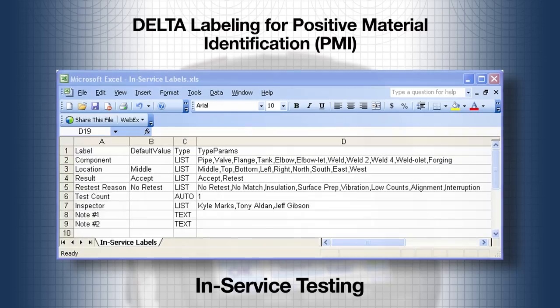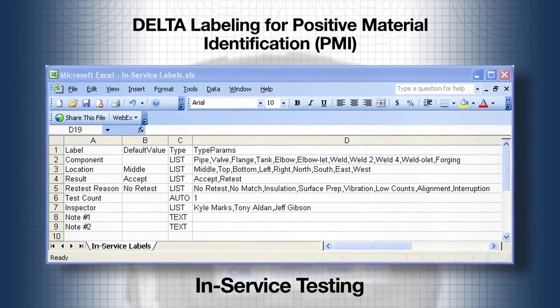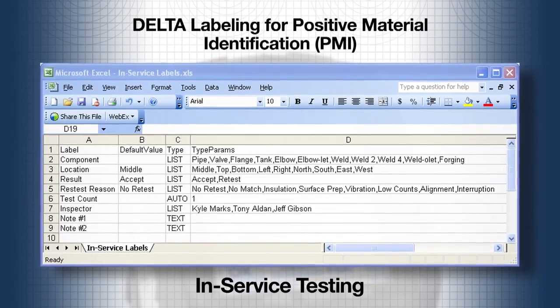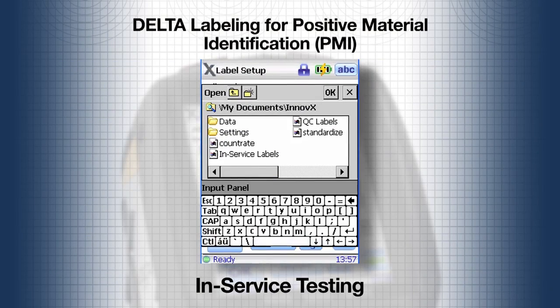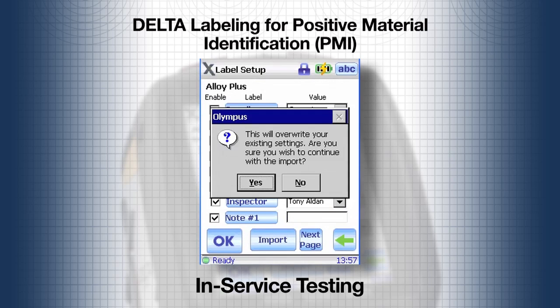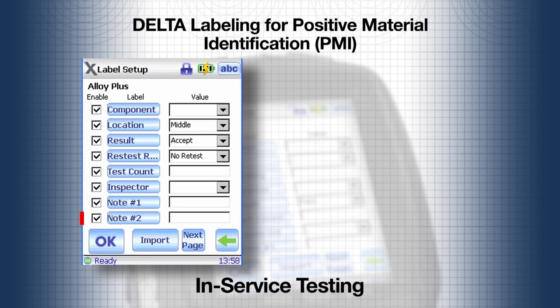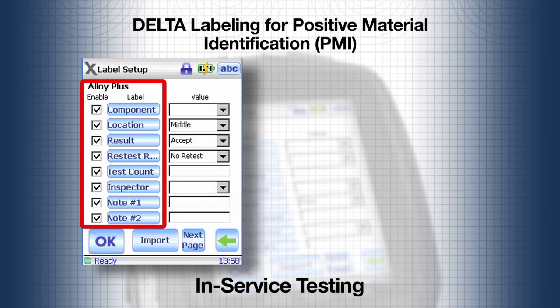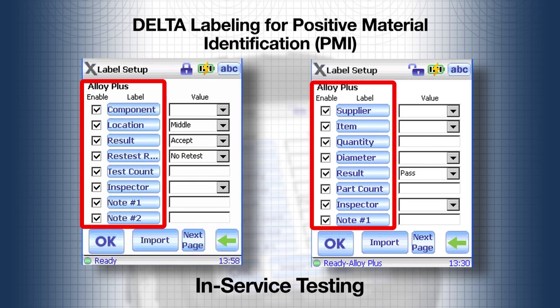Selecting a different set of labels to use is simple. The in-service testing labels and their options have been created in a spreadsheet, and the CSV version has already been imported into the Delta, so it just needs to be selected. Selecting the in-service label file changes the labels that the Delta will use going forward. The previous tests retain the QC inspection labels.